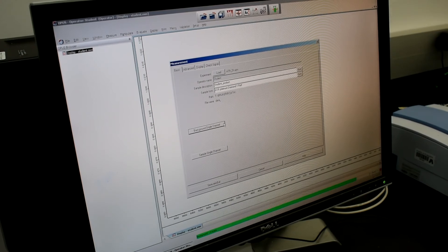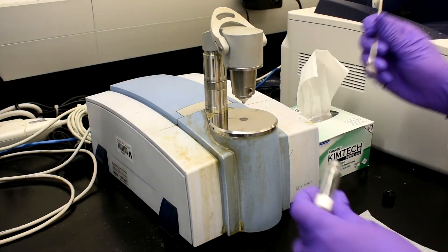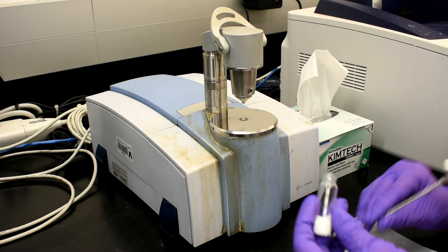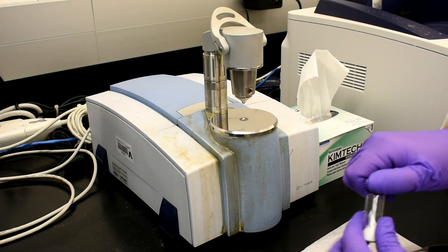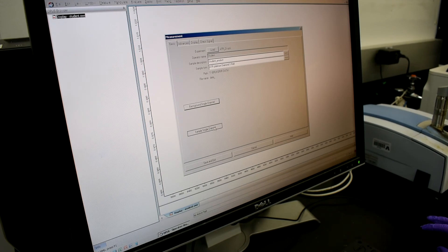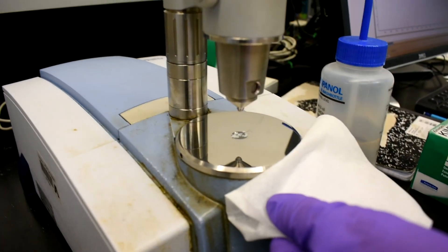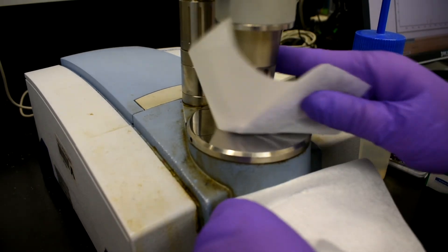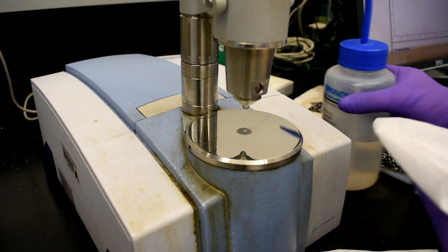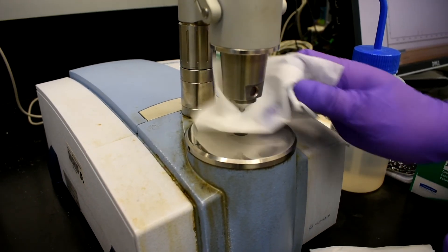Perform a background scan with no sample present — this will remove any background noise. To load your sample, raise the arm up and place just enough sample to cover the small square; you'll only need a few milligrams. Lower the arm and run your sample. Make sure to use the peak-picking feature to assign wave numbers to each of your peaks. After running your sample on the IR, make sure to clean the sample area using isopropyl alcohol and a chem wipe. Never apply isopropyl alcohol directly on the IR sample area.